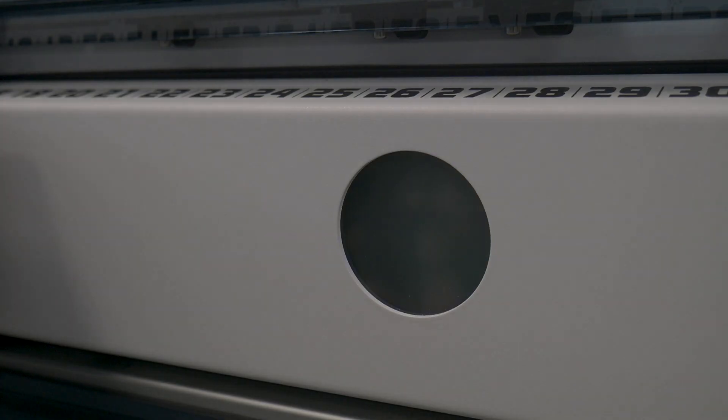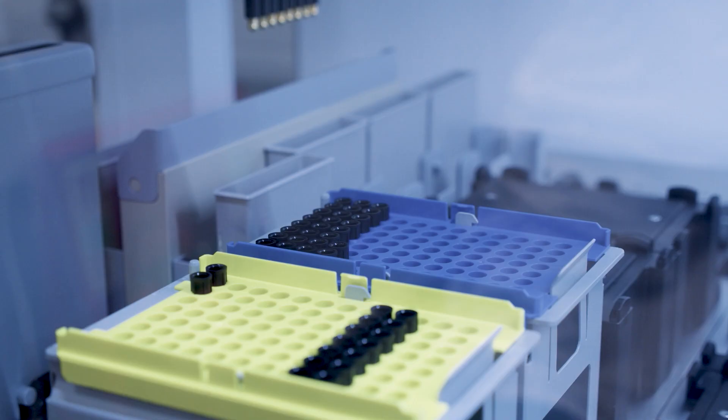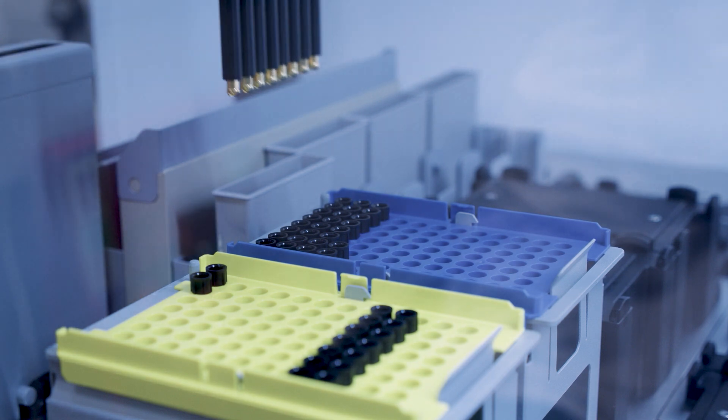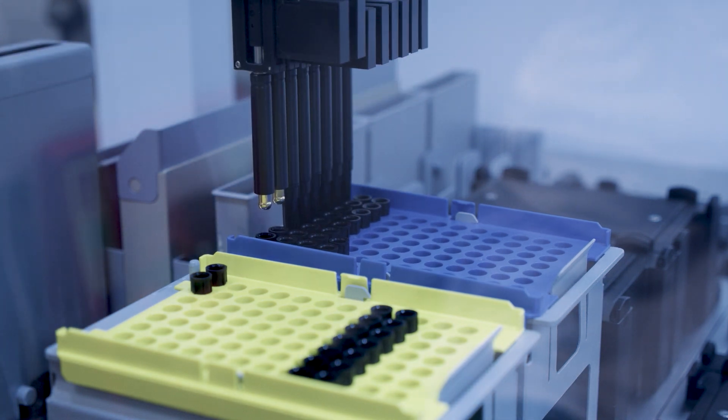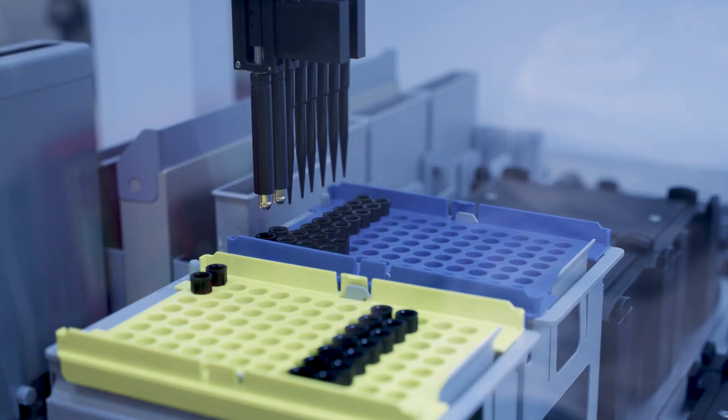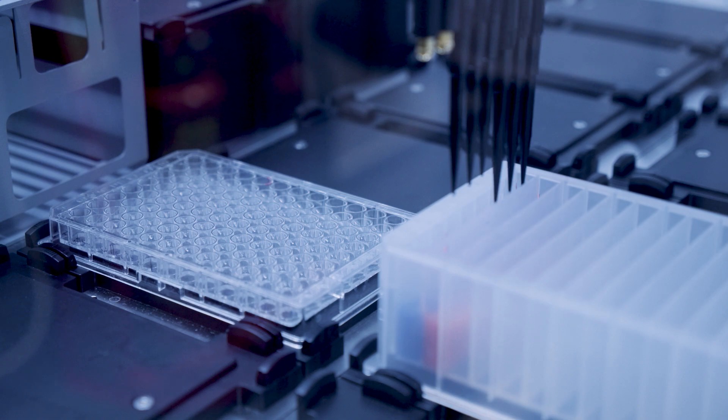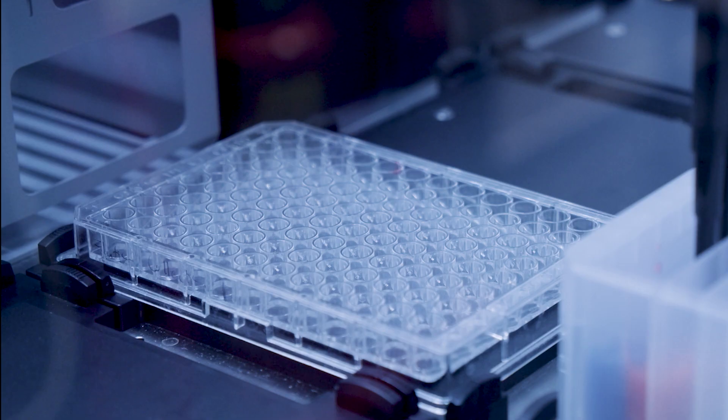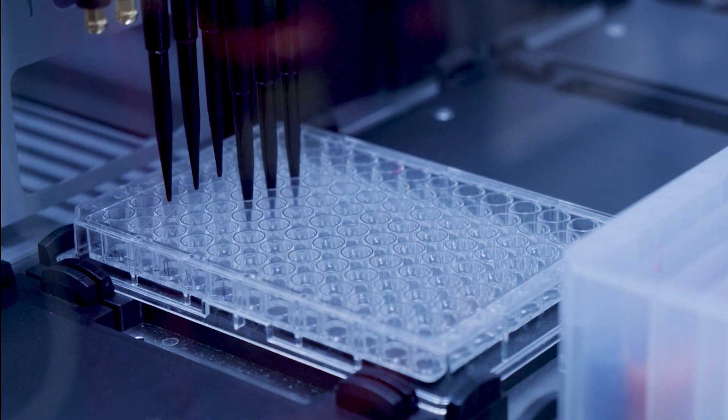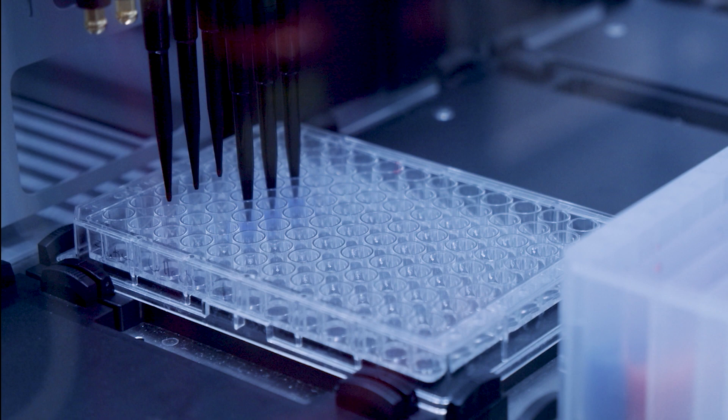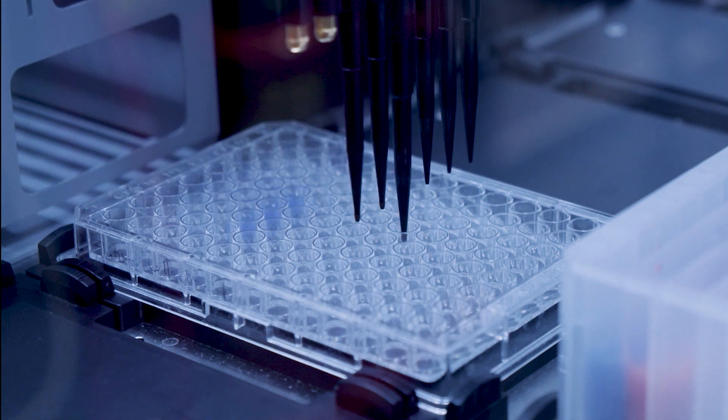Then the Fluent will kick into action and in this case pick up disposable tips. Then aspirate the input liquid and dispense it onto the output plate. The Fluent can dispense from multiple tips at once or individually.